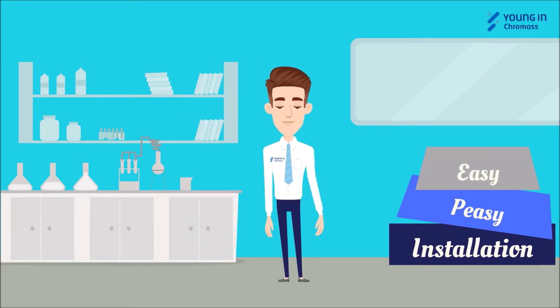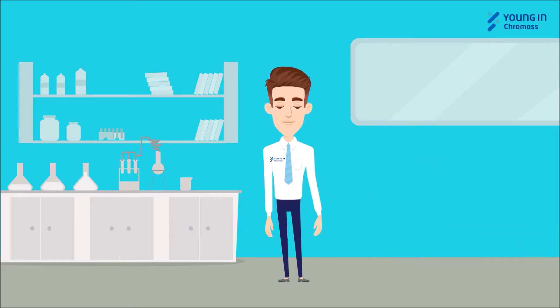Hi, I'm Chroma Doctor from Young In Chromass. I'm going to provide the easiest installation tutorial for the aquapuri system.